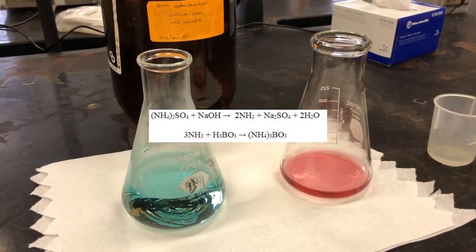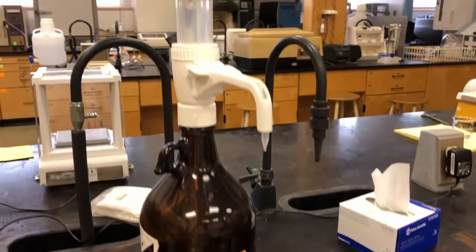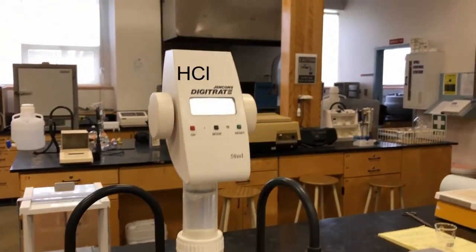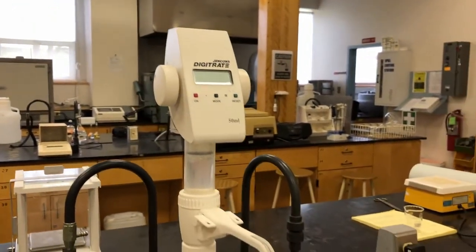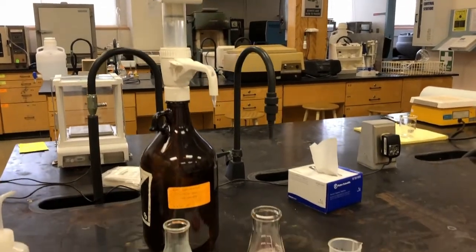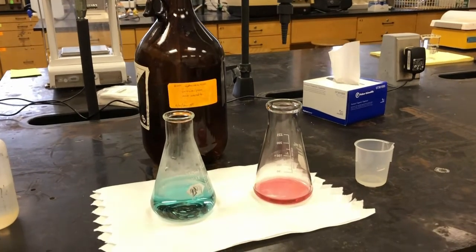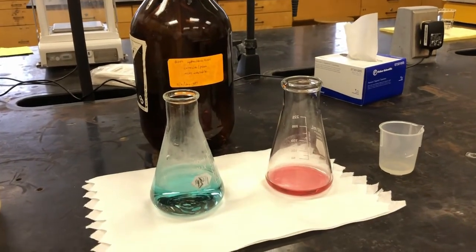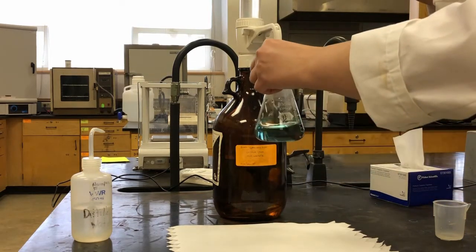So now we're going to titrate this with a solution of hydrochloric acid. We're using a digital titrator rather than a burette. And we're going to titrate that with hydrochloric acid, and the volume of the titrant that we use is the value that we'll use in our calculations to determine the amount of nitrogen in the sample. Okay, so let's start the titration.